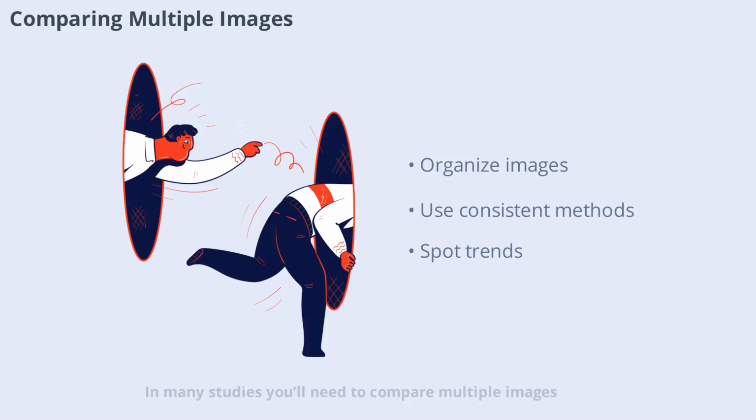In many studies, you'll need to compare multiple images such as samples from different conditions or time points. Organize your images systematically and use consistent analysis methods. Look for patterns, differences, or trends that support your research questions. Careful comparison can reveal subtle but important findings.